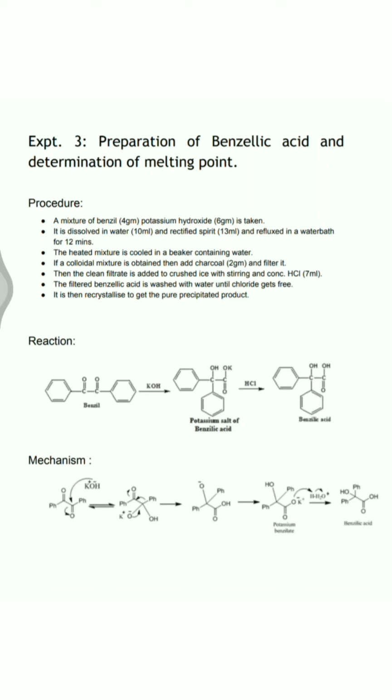After the college reopens, we can calculate the practical yield by weighing the product on the balance after doing the experiment. So the percentage yield will be practical yield by theoretical yield into 100, like the last experiment.